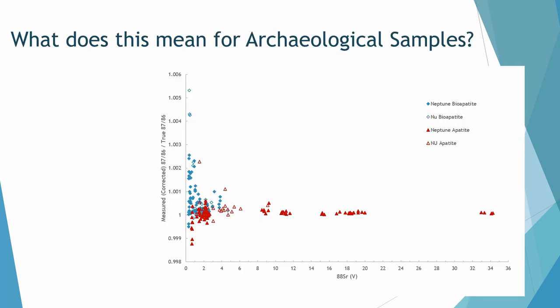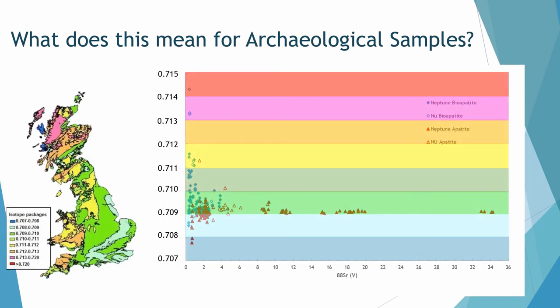What does this mean for archaeological samples? Splitting samples into bio-apatites and geo-apatites and applying the Evans 2010 map with the same colour scheme — assuming a line of unity at 0.709 — shows that any interpretations taken from these numbers would be very different, sitting in the 0.713 range rather than the 0.709 range. We clearly can't use data like this, but we wouldn't necessarily know without testing all tuning conditions what would create good or bad data.